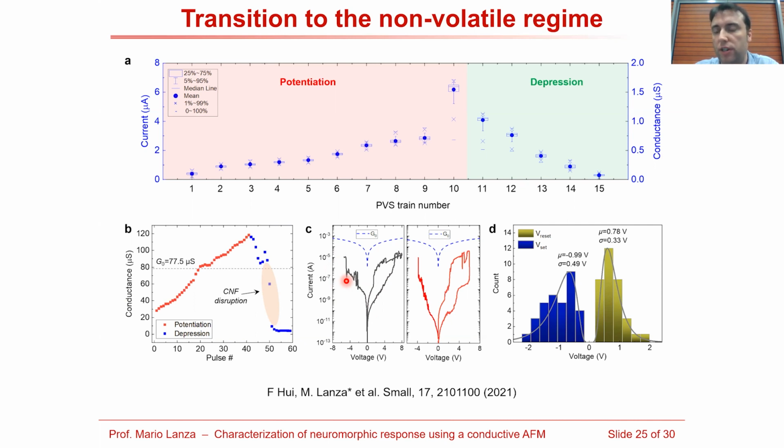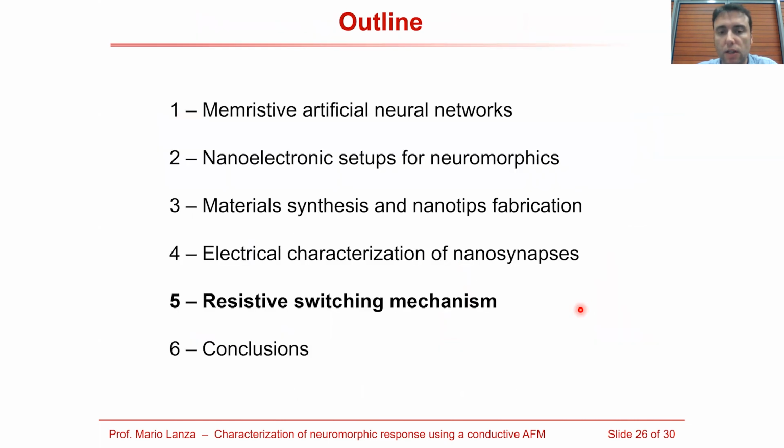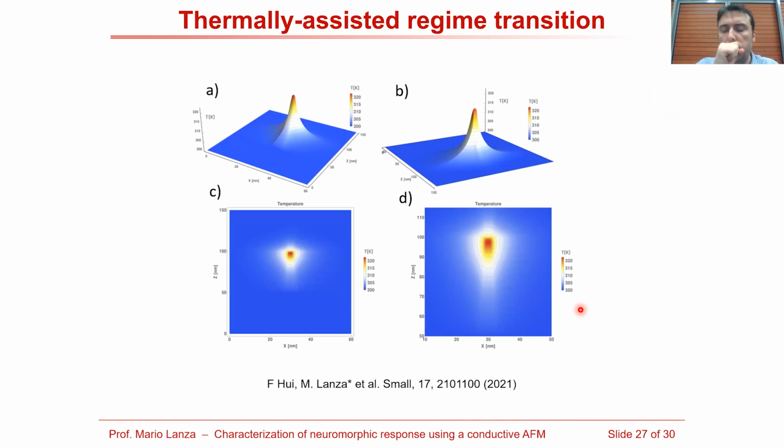All these currents are producing this bipolar resistive switching now. And we also analyze the variability of the currents and of the set and reset voltage, and we observe that they are not overlapping, which is something we needed also for our study. So in the next step, we analyze the resistive switching mechanism. We have done computational calculations to calculate the temperature that is being produced in the conductive nanofilament when we apply the electrical stresses to the copper electrode.